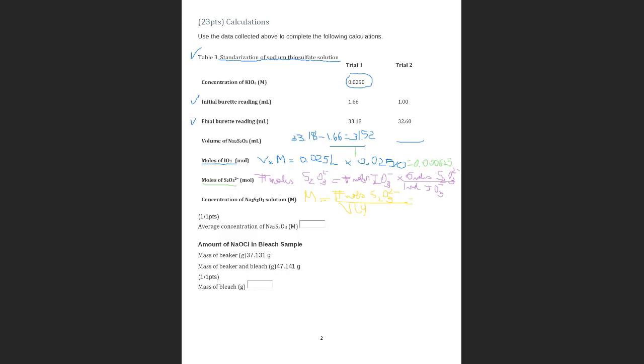In my case, I obtained 0.00375. And what is the volume? Obviously, it is the volume that we use in the end point, the volume that we use in the titration.